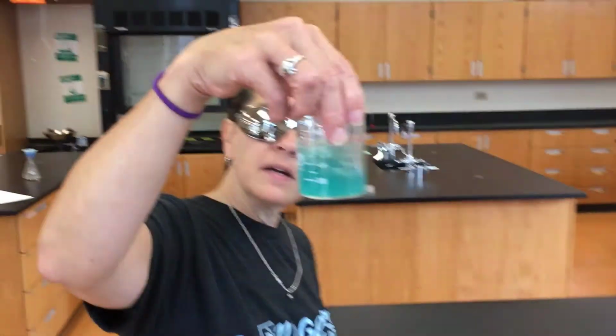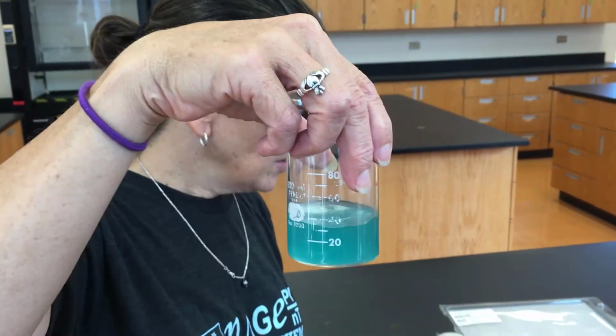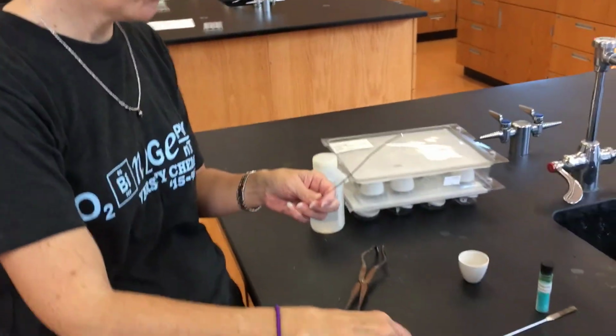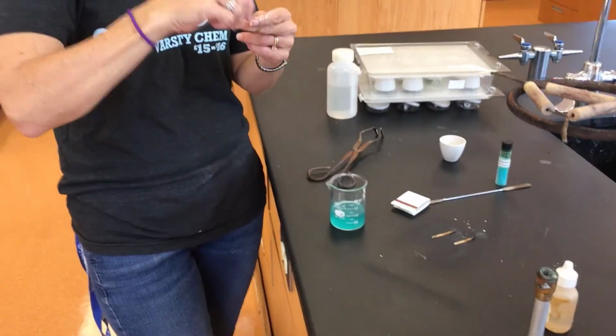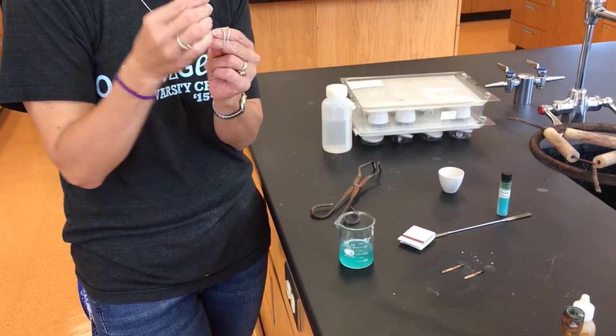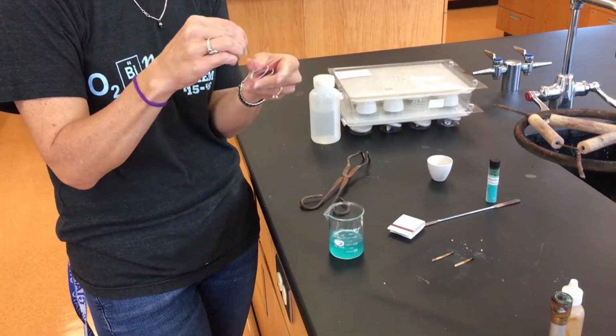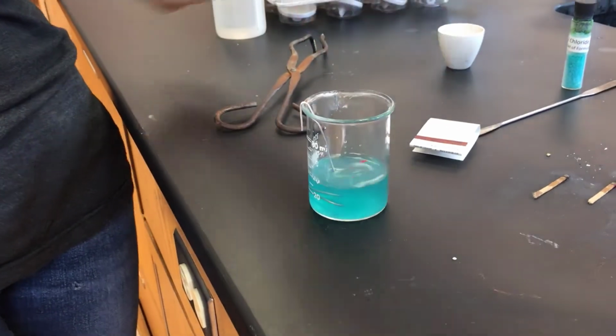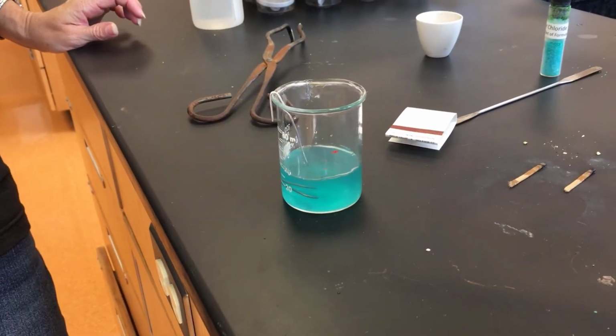And now, to get the compound to separate, we're going to do a replacement reaction using aluminum. So I'm going to coil up the aluminum, leave myself a little handle so I can come back and get it the next day, and I will hang that aluminum inside the beaker. And now we wait.